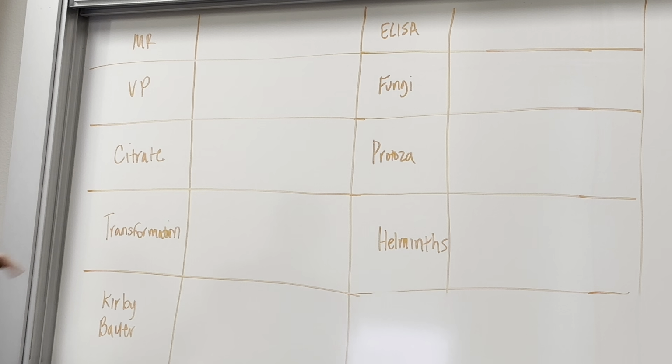Okay, so transformation. There were a lot of pieces to this lab, but what was the main purpose? Everybody think about it really quick before you answer. What were we transforming? What were we transforming to and from? What did it mean?